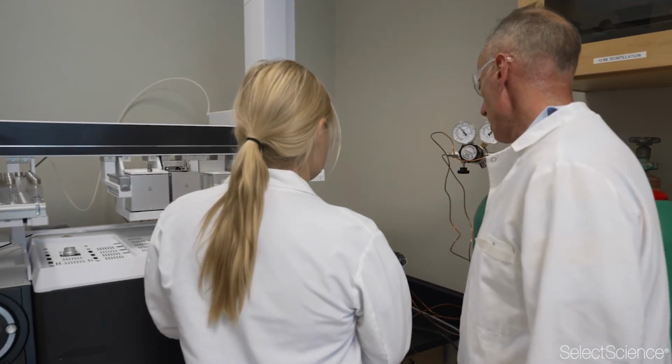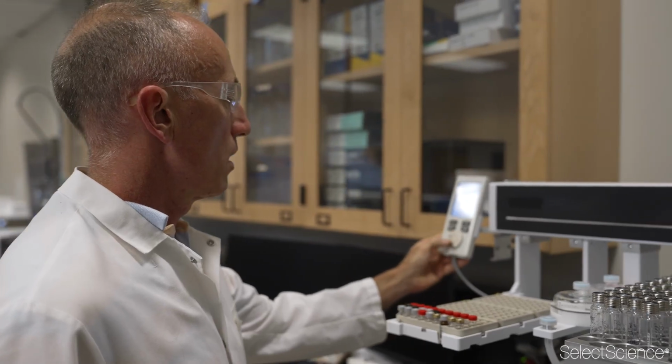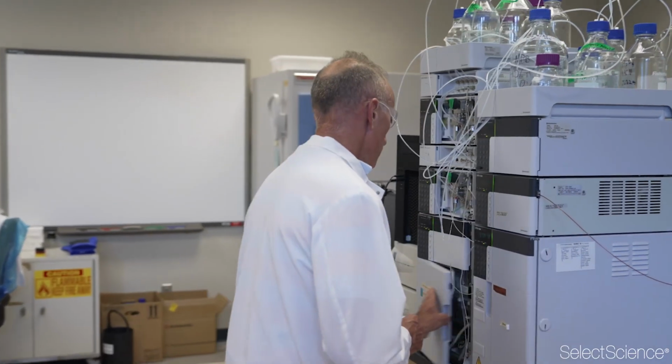If you sit and think about different documents such as the Declaration of Independence or the Gutenberg Bible, the end goal is to make certain that these documents last as long as possible. So we're combining the metal content work that we're doing along with other characteristic traits that the Library of Congress has developed to optimize conditions for having the paper last as long as possible.